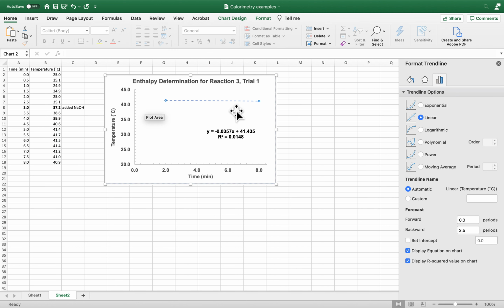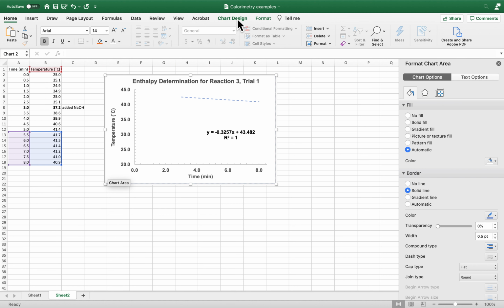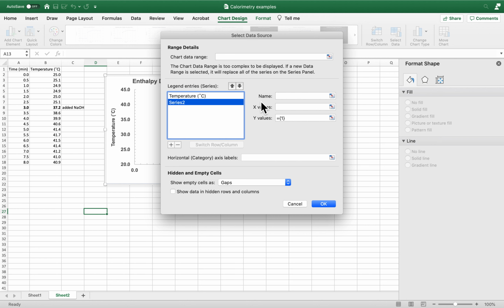So remember now that we want, and then now I can't find the markers because I made them disappear. There they are. We only want to fit the 5.5 to the 41.7. So now we have our trend line already there. Then I can re-add the data. Let's add again the temperature in degrees Celsius.